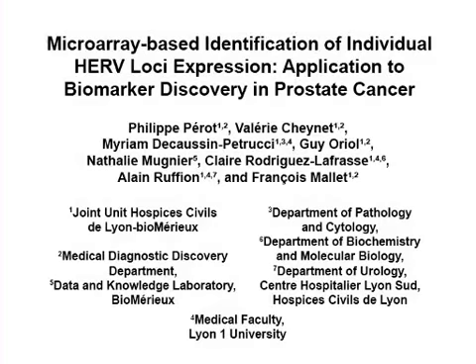This transcriptomic analysis of human prostate cancer tissues identifies individual human endogenous retrovirus expression loci to evaluate a custom high-density microarray as a screening tool for biomarker discovery.